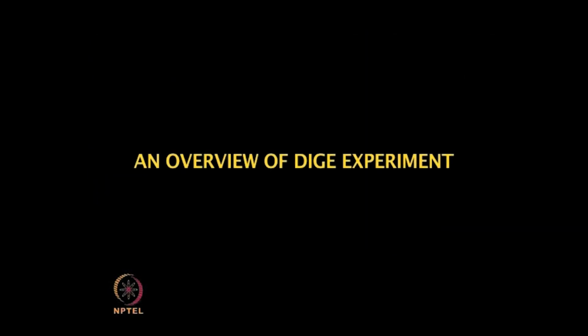Yes, there is another video which you can see now. This is the second video, where you can see it more elaborately. This is particularly a protocol which is developed for membrane protein analysis. Now you can see this video.